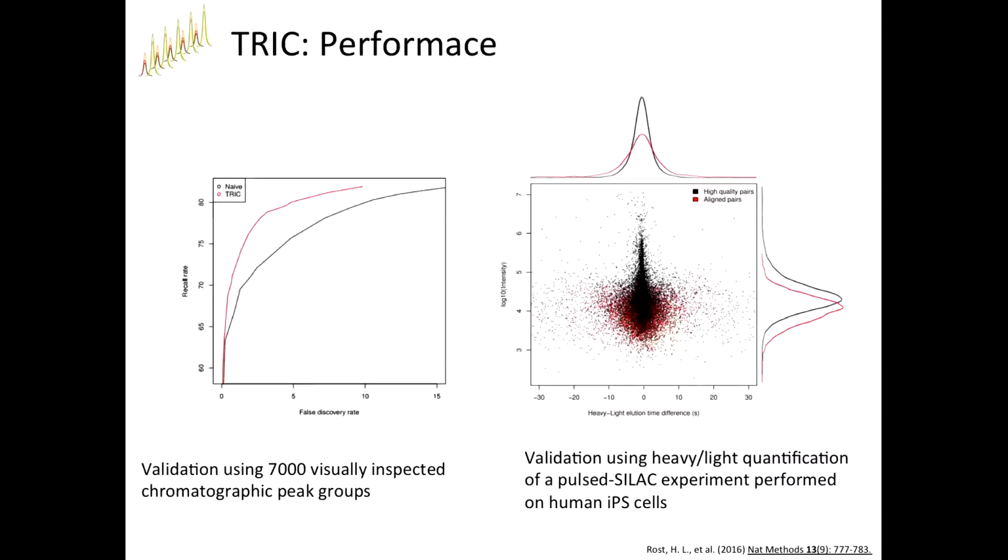Yeah. So in the tutorials, also on Thursday, I think, you will run PyProphet, and what you get at the end is a PDF which will report the discriminant score distributions and the p-value histograms.